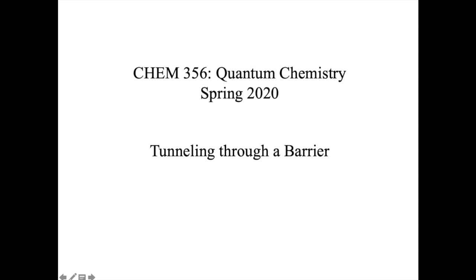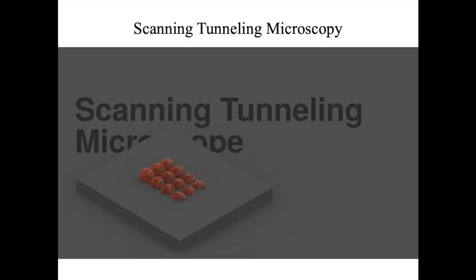Okay, class. So before we get to our next exercise in the notes, I wanted to take some time to show a little bit more detail about scanning tunneling microscopes and show you a video and some recent literature. So in this video, we're going to see exactly how an STM works, and there's some captions at the bottom that I'm just going to narrate for you so you can watch the video.